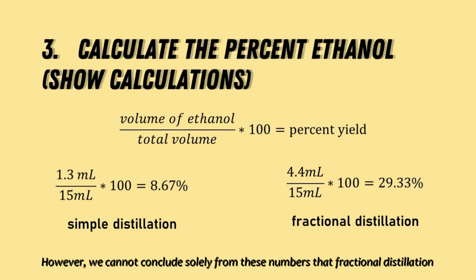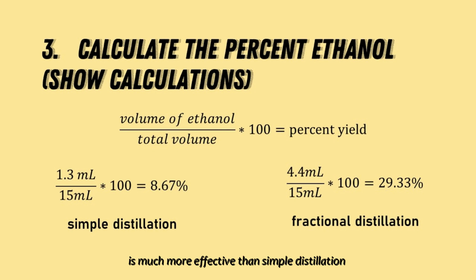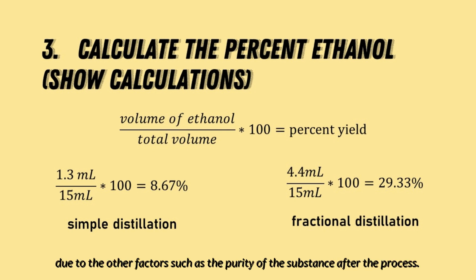However, we cannot conclude solely from these numbers that the fractional distillation is much more effective than simple distillation due to other factors such as the purity of the substance after the process.